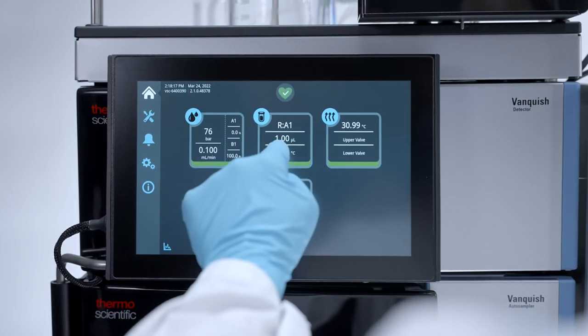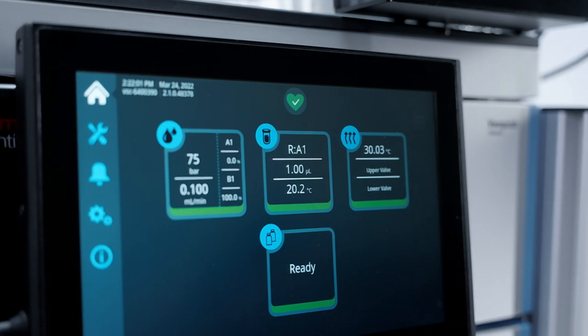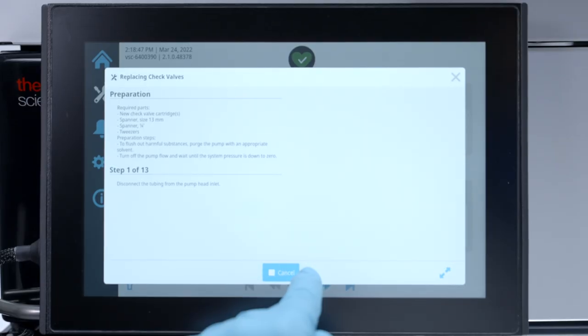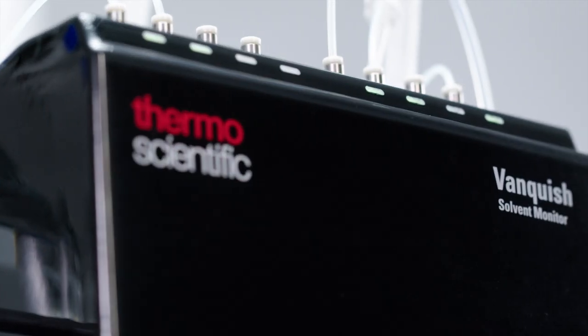The Vanquish platform also exemplifies intuitive operation through features like the touchscreen Vanquish user interface for at-system and remote instrument control, guided diagnostics, and step-by-step maintenance tutorials.